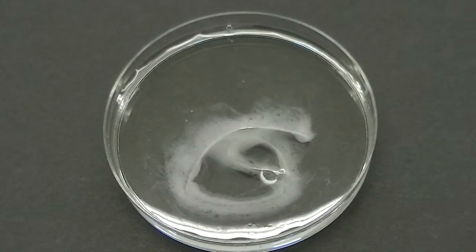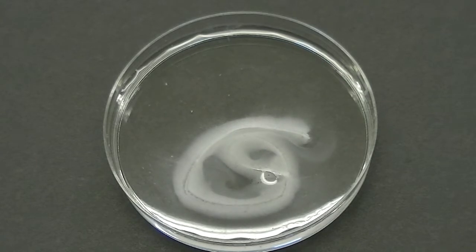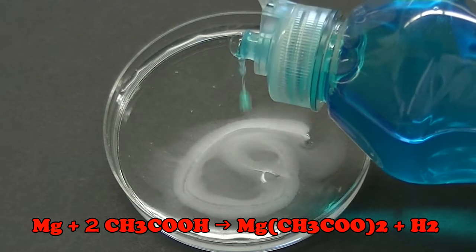We immediately notice the formation of bubbles. Those bubbles are the result of hydrogen gas that's produced in the reaction between acetic acid and the magnesium strip.